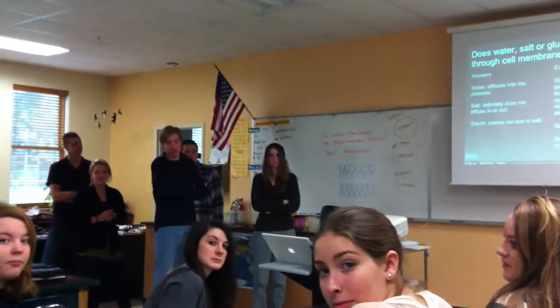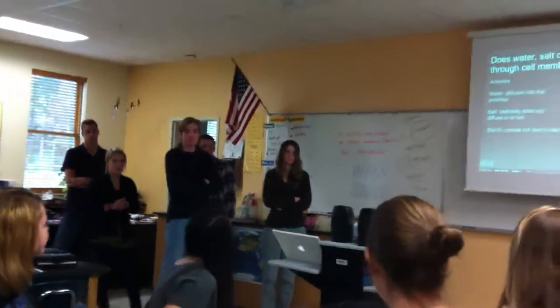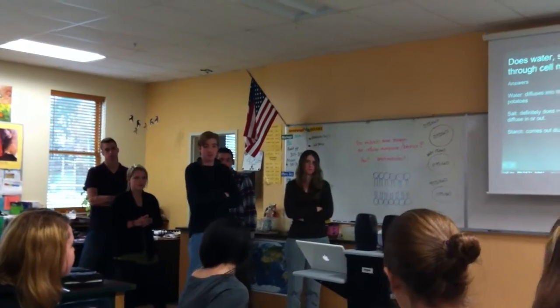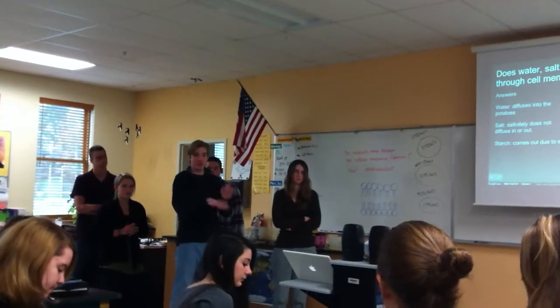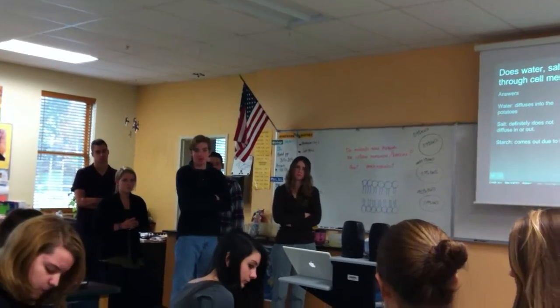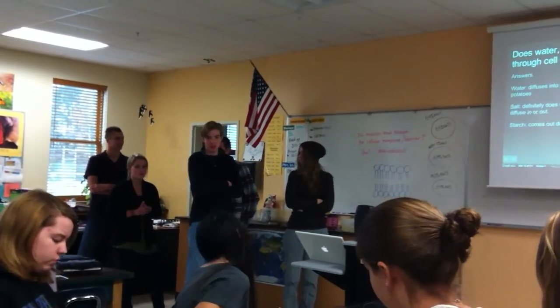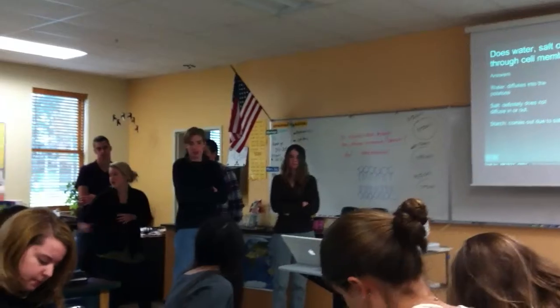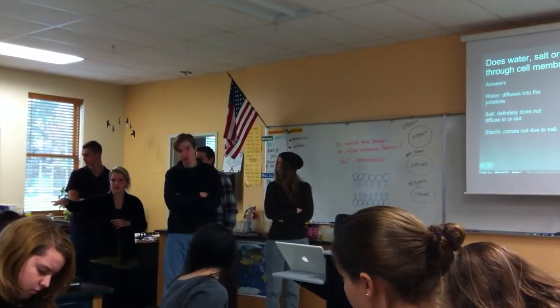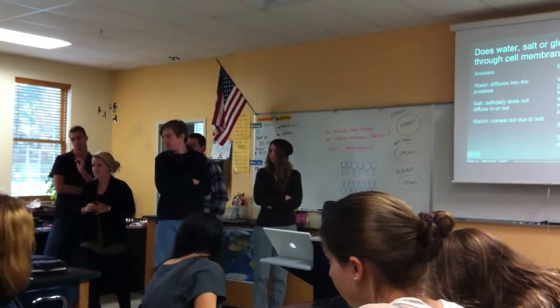So in the water you didn't see starch leave, but in the salt you saw starch leave, that's why you're saying that starch is moving because of salt. Yeah. Interesting. When did you see that? Did you see that in your first days or just in the second day? In the first day. And the starch is at the bottom of the beaker now. It's settled. Do you want to pass that around so people can see what you're talking about?